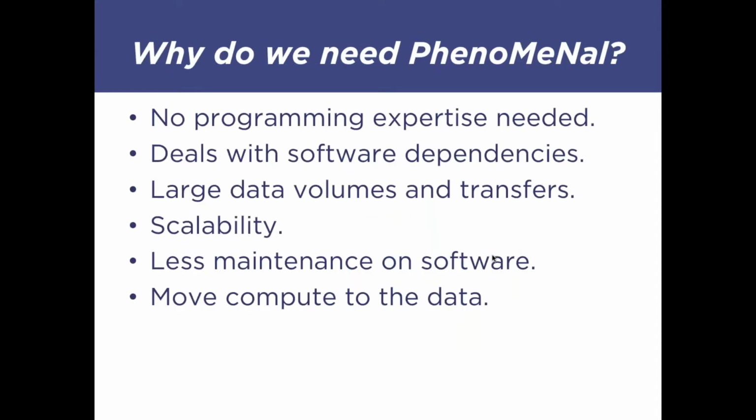So why would you need PhenoMeNal? Well, if you don't have any programming expertise to be able to deal with maybe our tools, then we have a number of metabolomics data analysis tools in R and Python that are already packaged and installed for you, so you don't need to worry about installing them. You don't need to worry about dealing with their dependencies, which if you have installed scientific software, you will know is a complication many times. You can do larger data volume analysis and transfers compared to the previous case. This in turn allows you to scale in your analysis, as I was mentioning before.